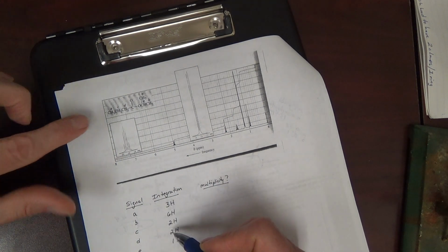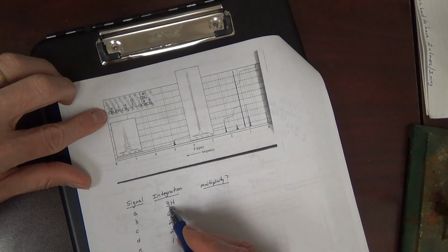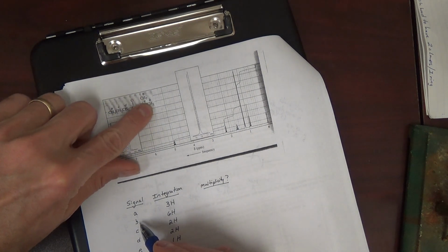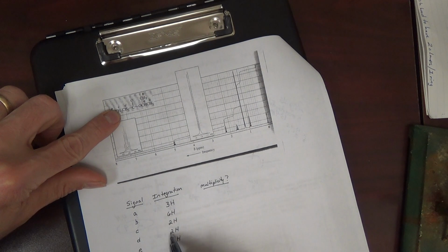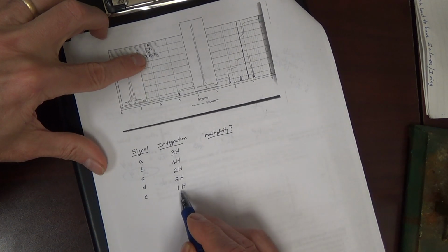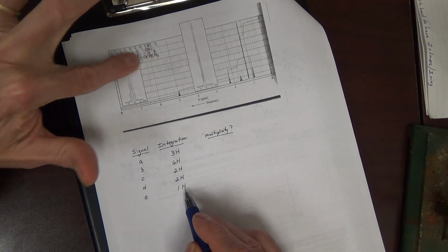Now integration, since we have the structure, integration just comes from the number of protons. The A signal is 3. The B signal is 6 because there are 6 H's that are B. The C signal is 2. The D signal is 2. And the E signal is 1. Okay? So we know what integration we expect.